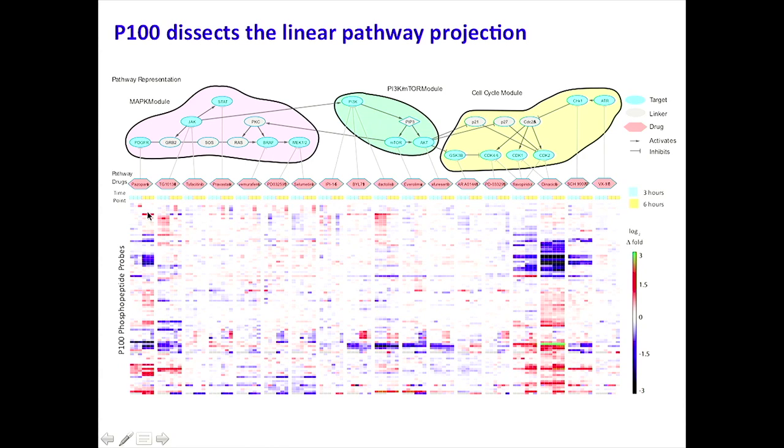The chance of these 2 neighboring drugs having a similar signature, we thought, by looking, would be greater than comparing something to over here. And then you can see here other compounds in the cell cycling module. They have similar but distinguishable signatures, at least by eye.